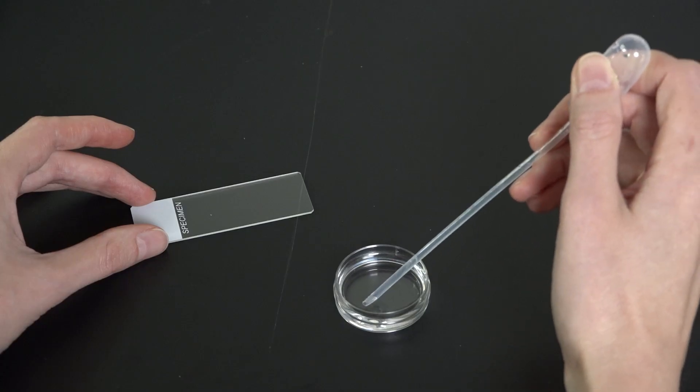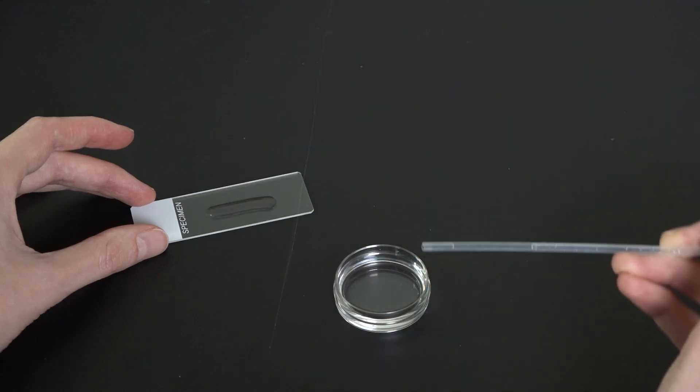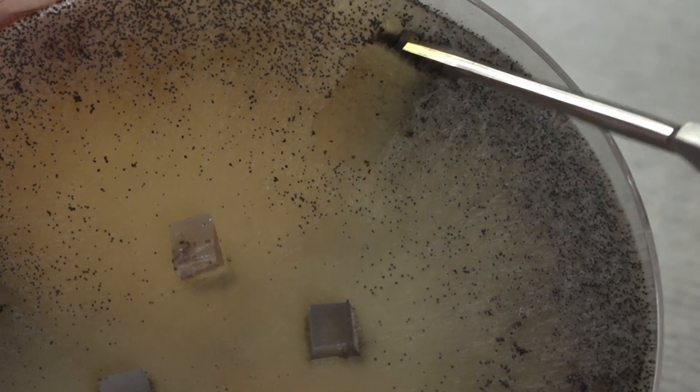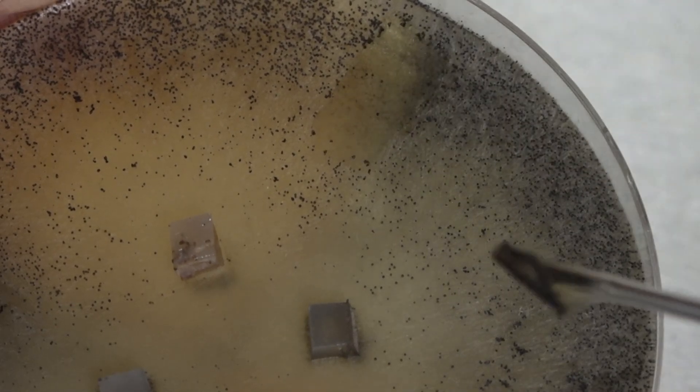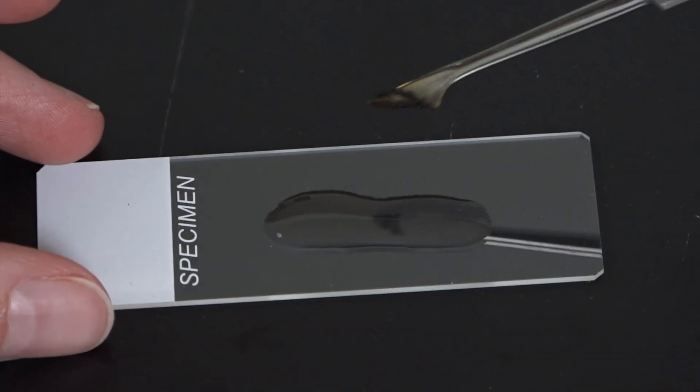I'm going to put a drop of water on my microscope slide and then scrape some perithesia from the Sordaria plate using my scalpel. I'll make sure to scrape where the strains meet on the plate so that I get perithesia that are the result of reproduction between the two. Then I'll transfer the perithesia to the drop of water.